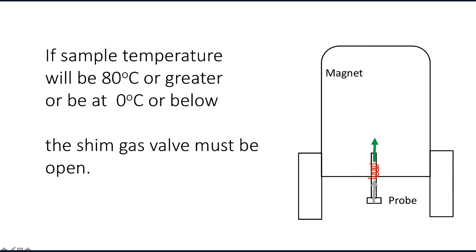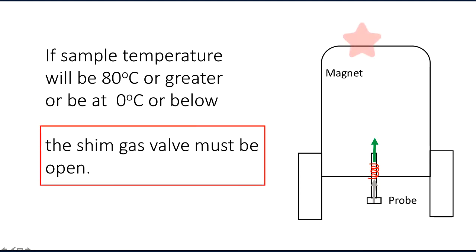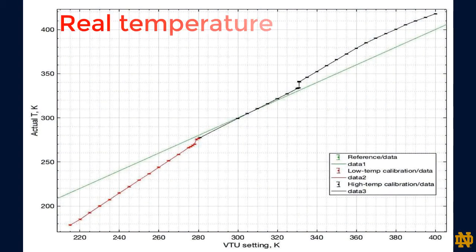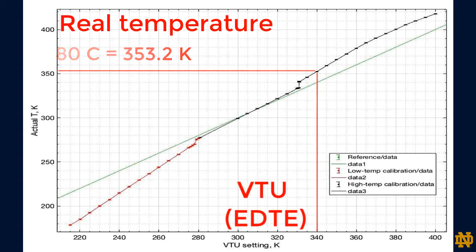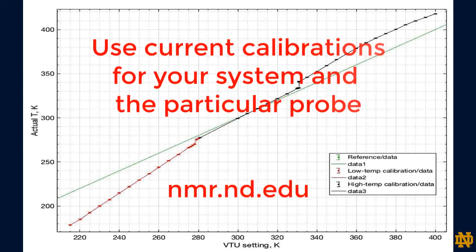When sample temperature is set to be at 80 degrees C or greater, or at 0 degrees C or below, we must open the shim gas valve. The valve is located on top of the magnet and allows a stream of dry nitrogen into the shim stack to protect it from freezing or becoming too hot. Very important: 0 degrees C and 80 degrees C are real temperatures. You must use calibration graphs to determine what VTU setting you put into the EDTE window for these temperatures. Please refer to current calibrations for your system and probe available on our NMR website.